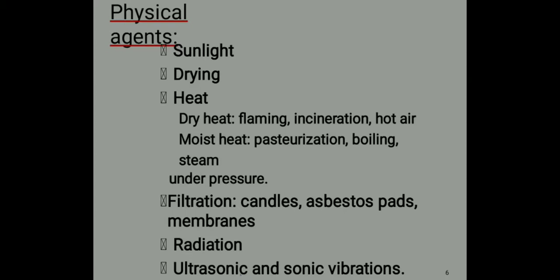Next we have filtration, using different candles, asbestos pads, and membranes. Then we have radiation, and ultrasonic and sonic vibration.